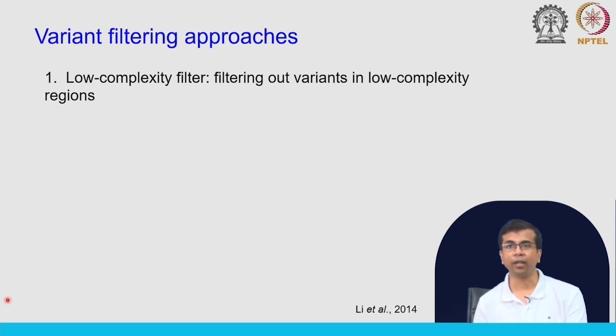Something that we discussed and you can probably relate to is the variants present in the homopolymeric stretches in the 454 data, and similarly the Ion Torrent data. We have a lot more error in those regions, and perhaps we need to be very careful, or maybe we can filter out variants in those regions altogether.